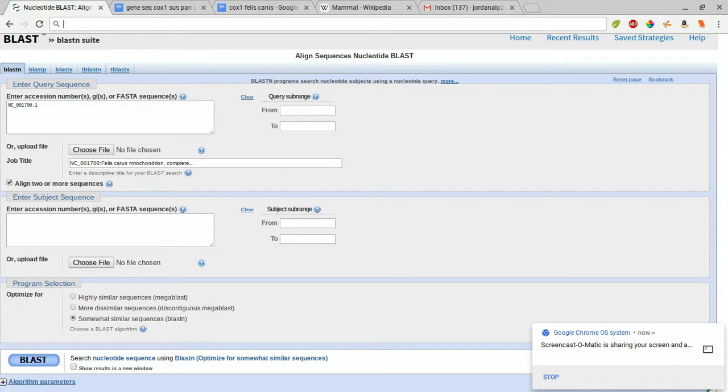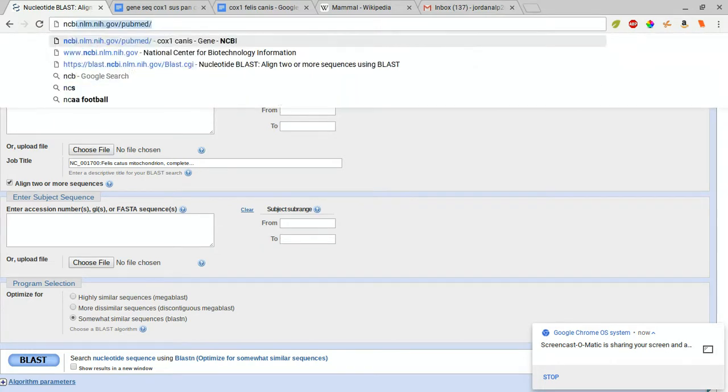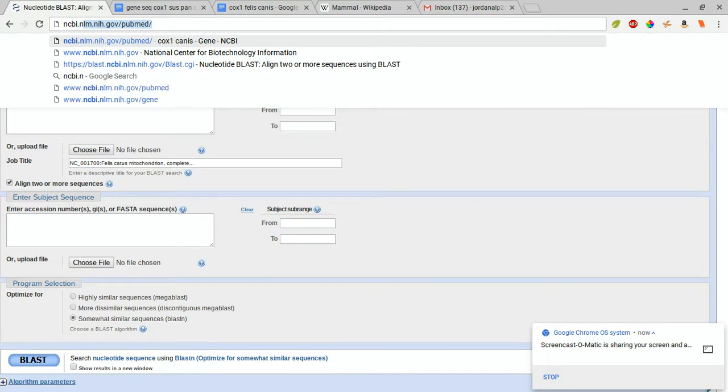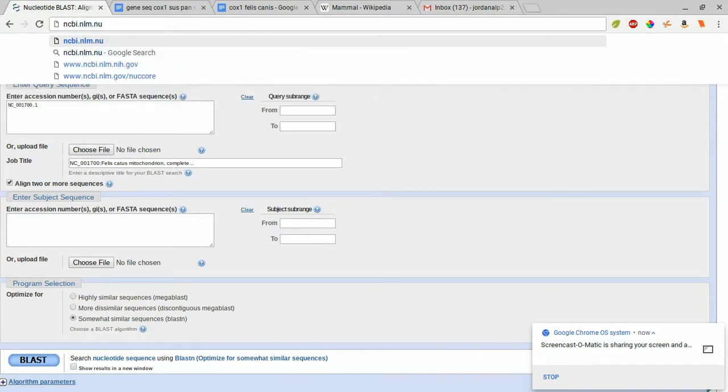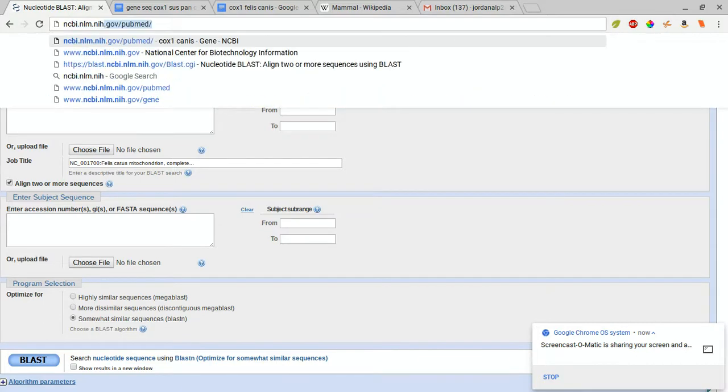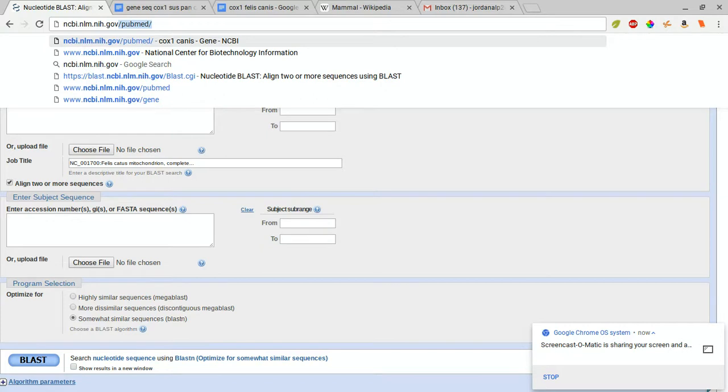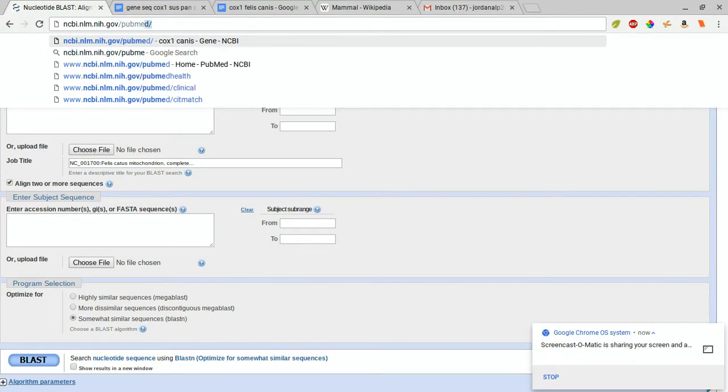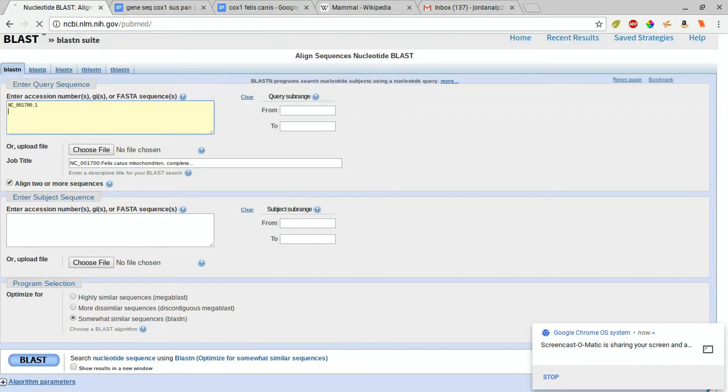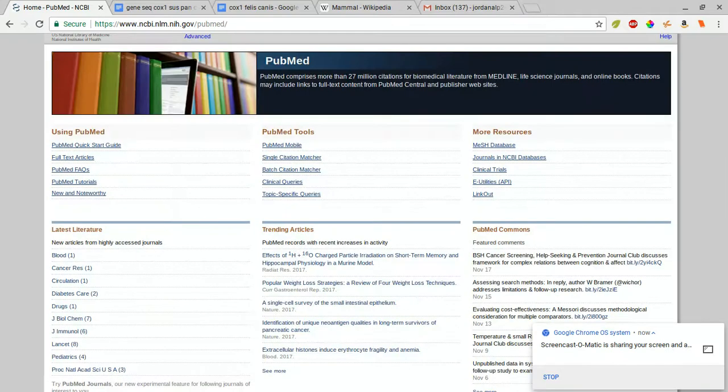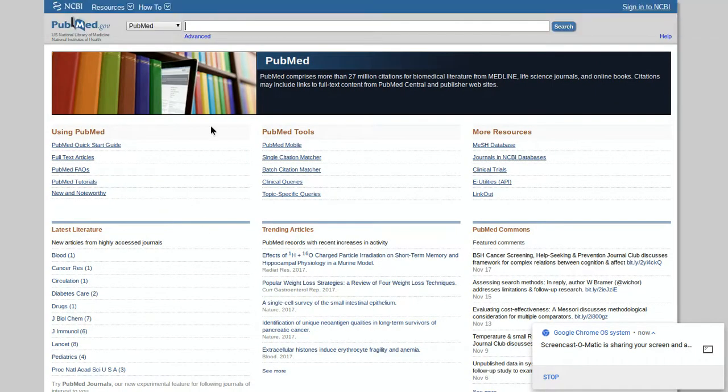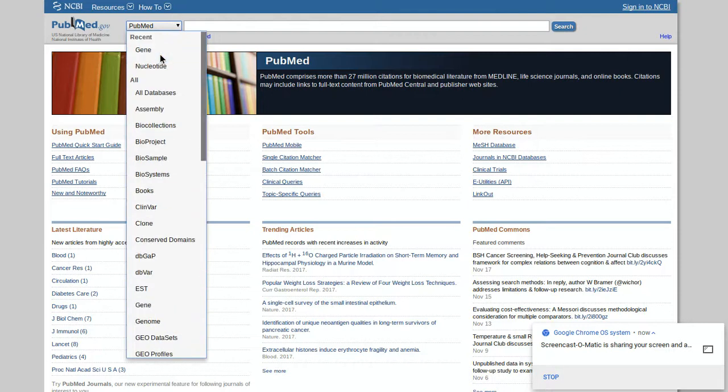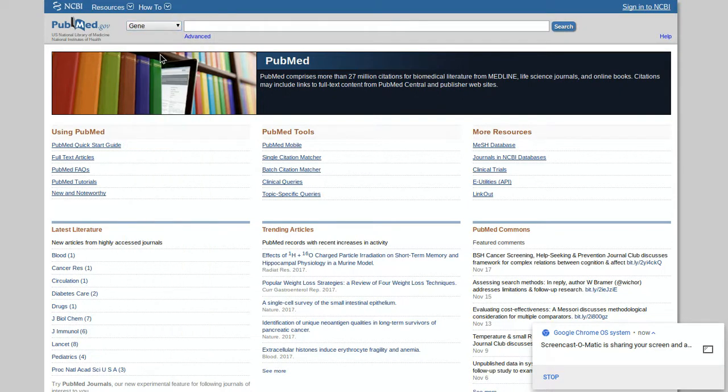We're going to go to ncbi.nlm.nih.gov. After you get here, to the left of the search box, you select gene.